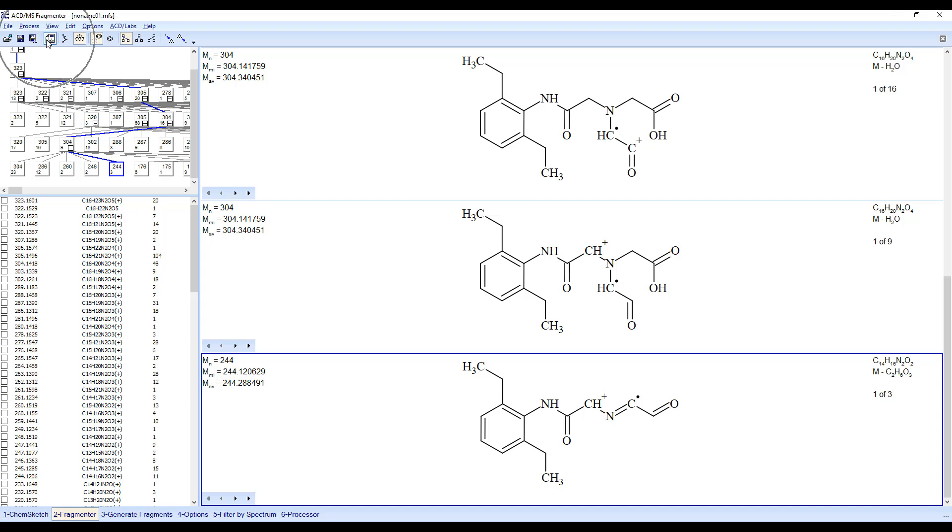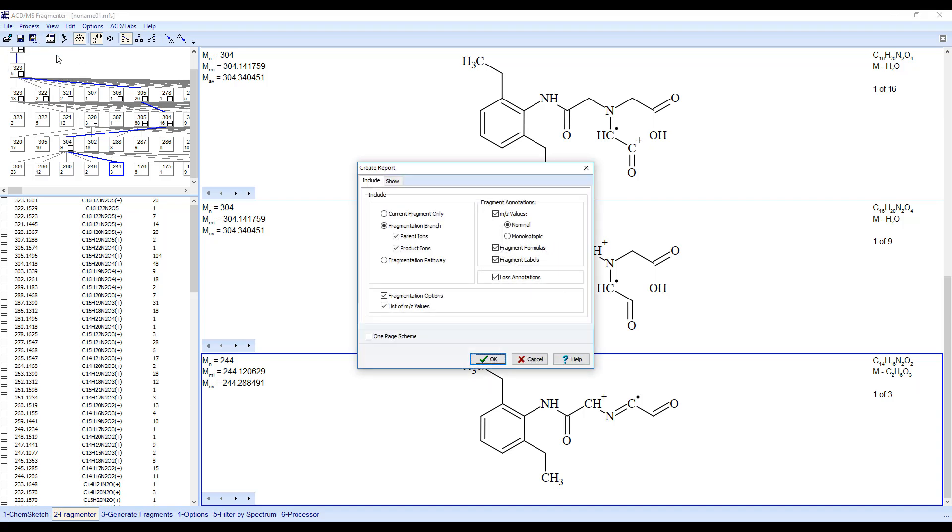You can generate a report by clicking on the Report icon. Here, you can select what you would like to see in the report.